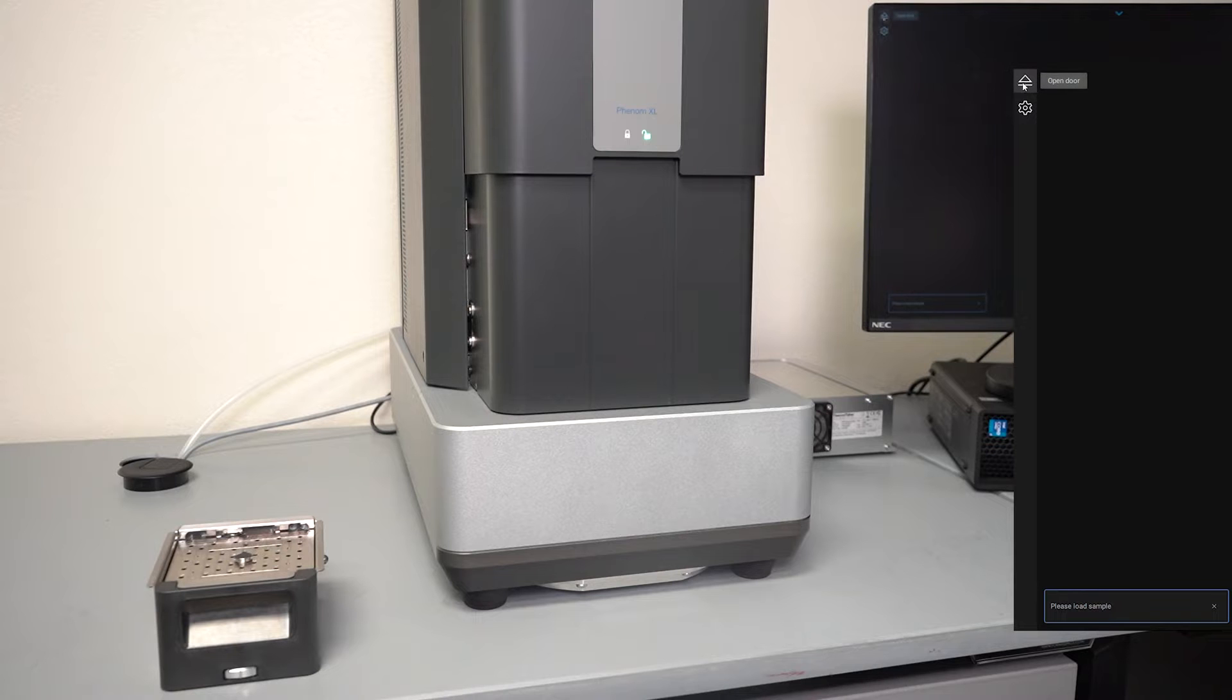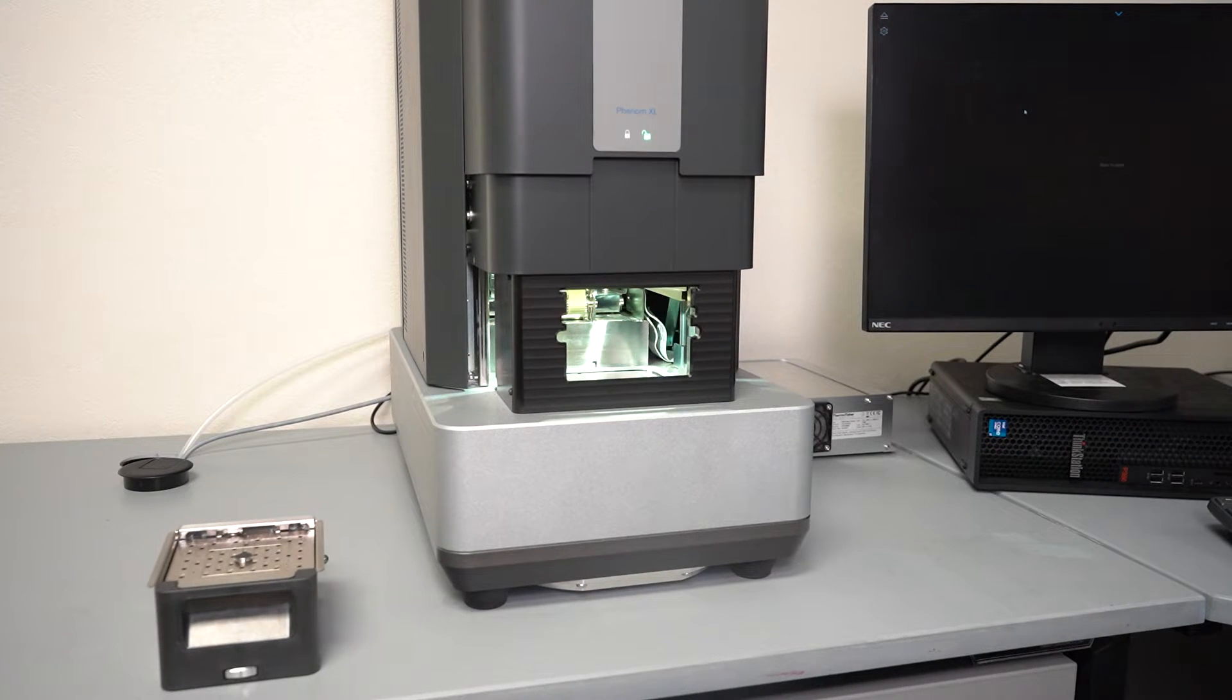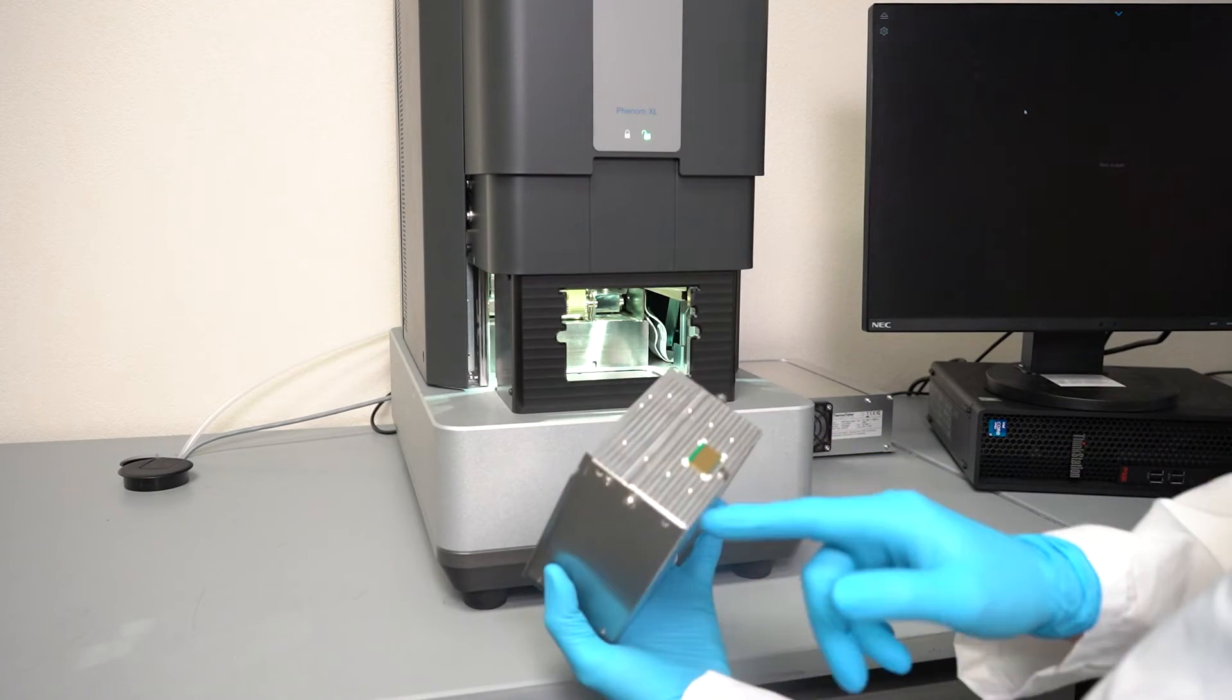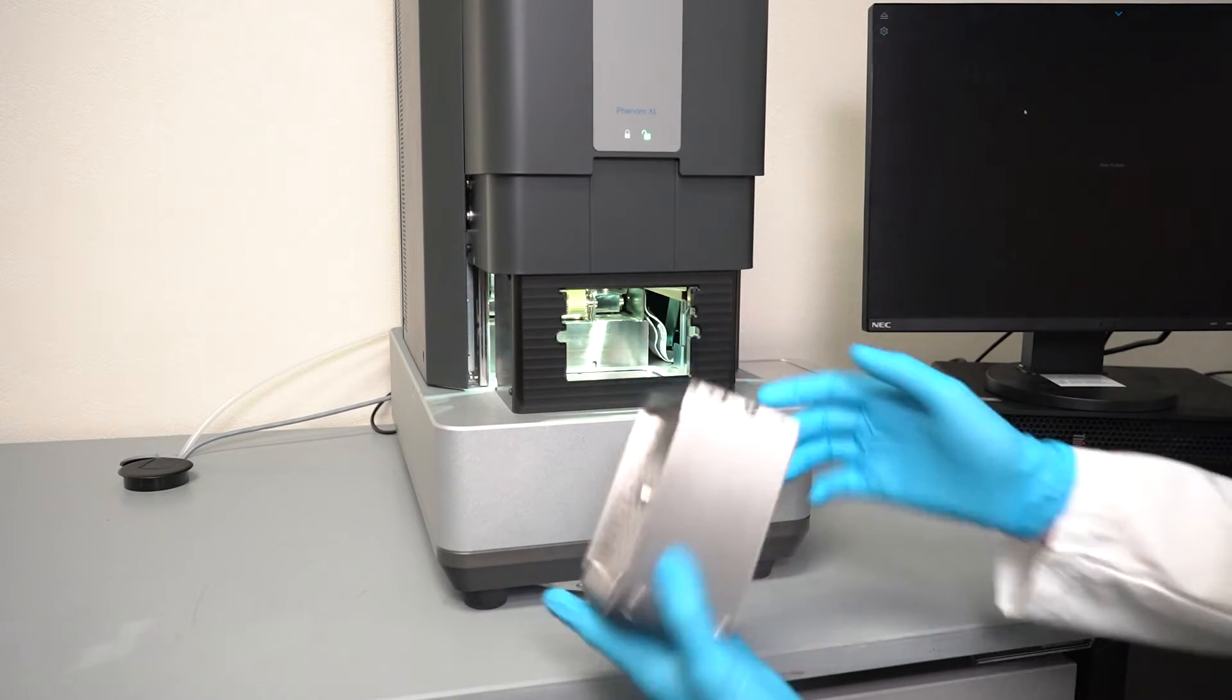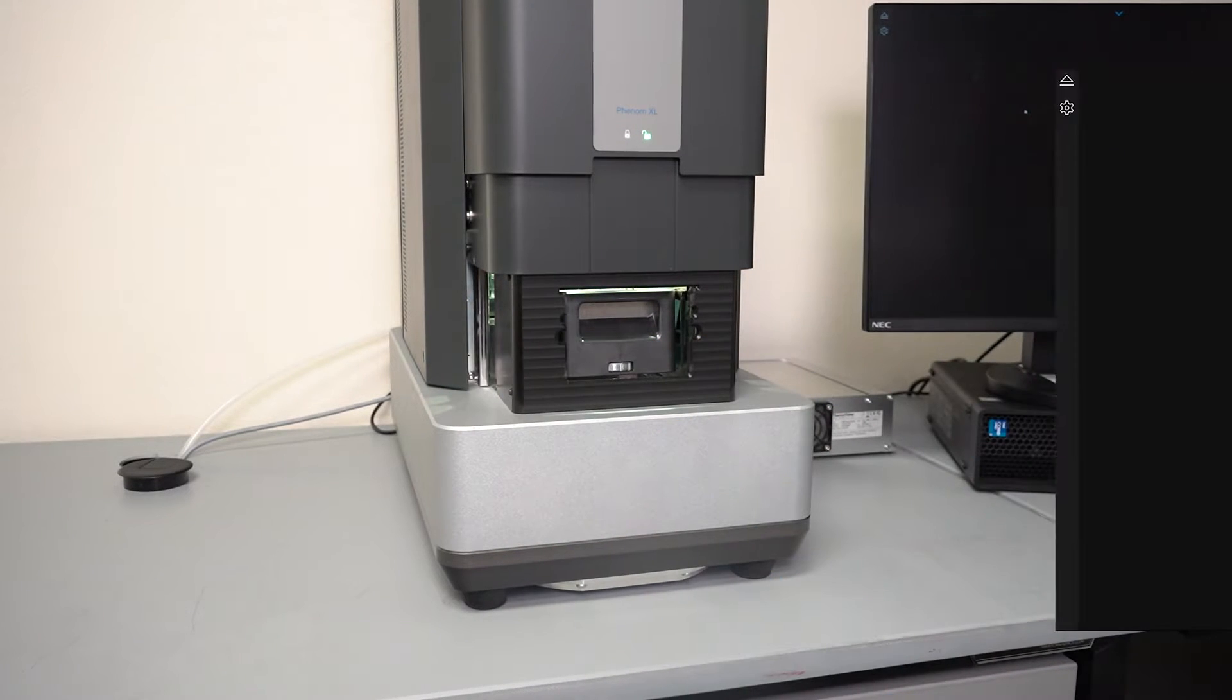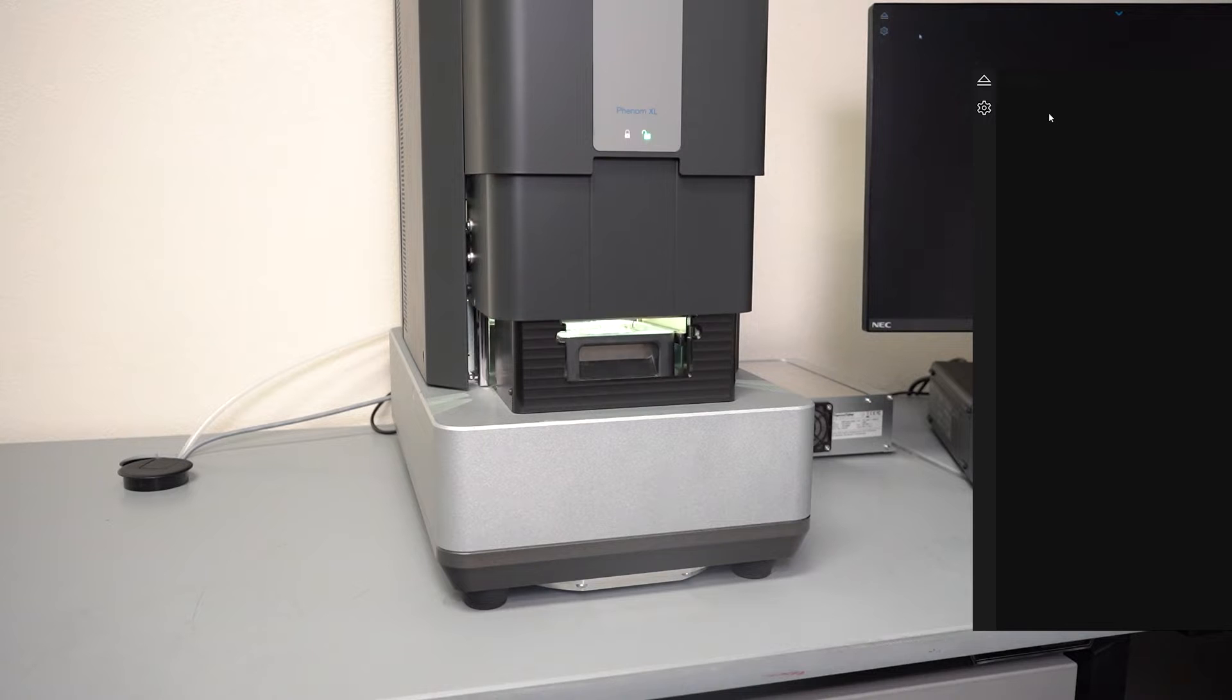Now just by clicking the unload button on the desktop SEM the door automatically opens up. I line up the pins with the notches on the sample holder, load it inside the SEM, and then click the button again to close the door.